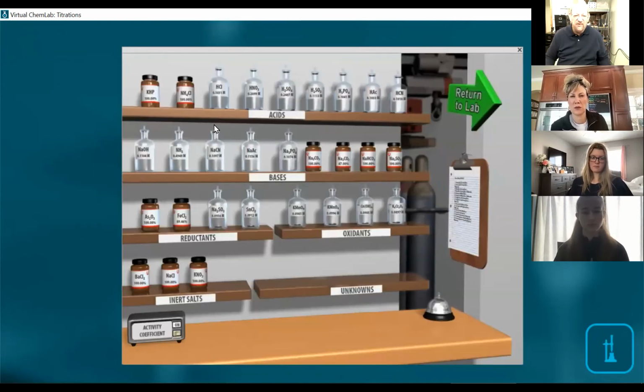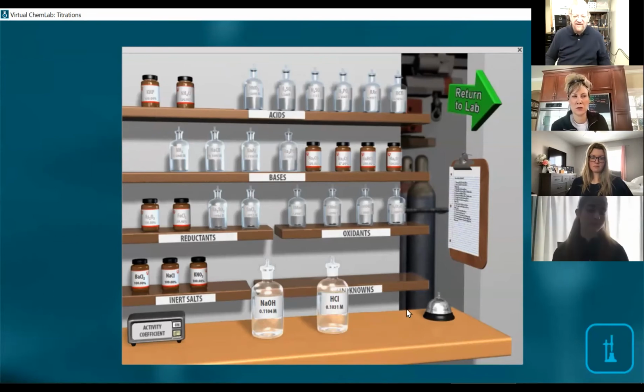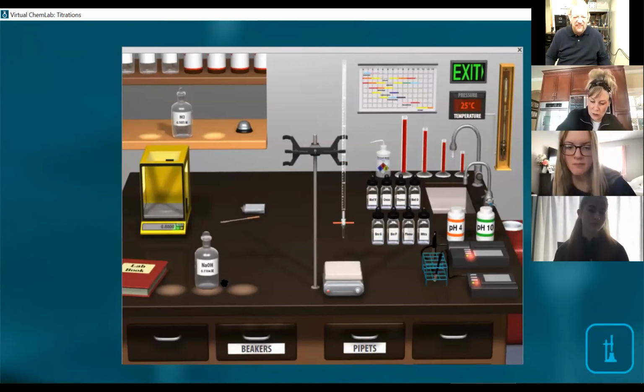And you can go to the storeroom and say, no, I don't want that one. Let's say no, I don't want that. Sodium hydroxide solution. And I'll take hydrochloric acid. And now I'll return, and notice they're up here on the shelf for you to use.